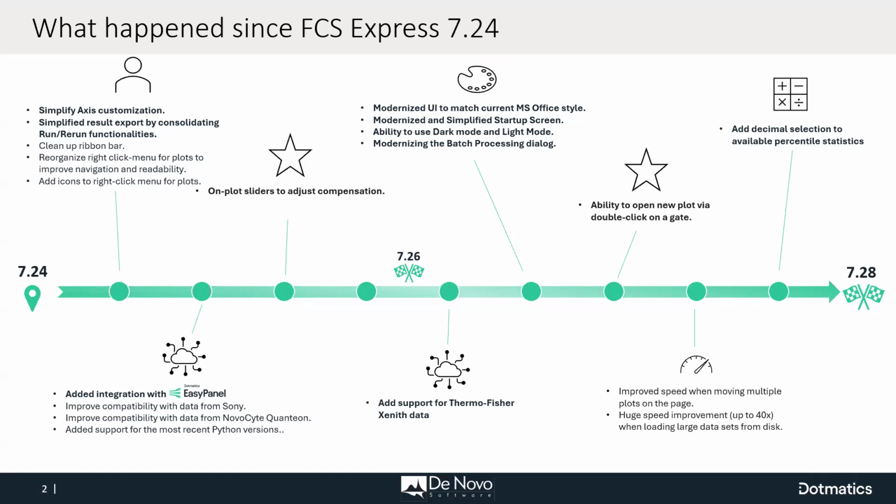And at the end, I also want to show you what we've done in terms of percentile tokens. And I want to show you a couple of examples in which this can turn out to be very useful.